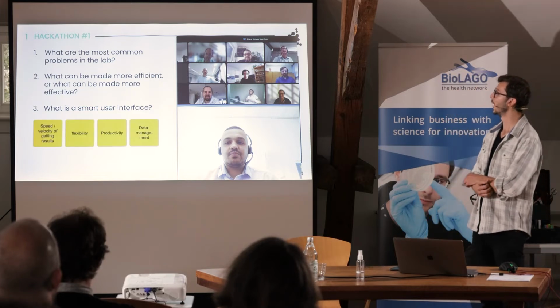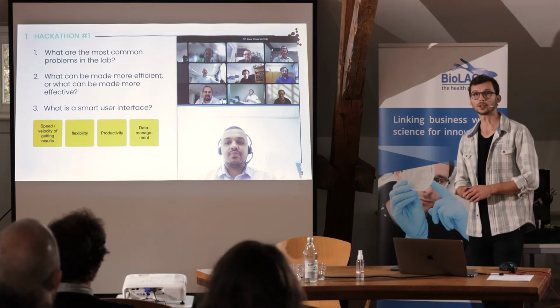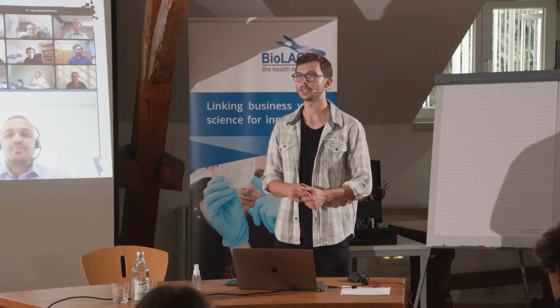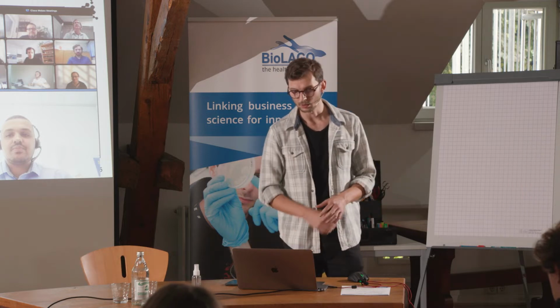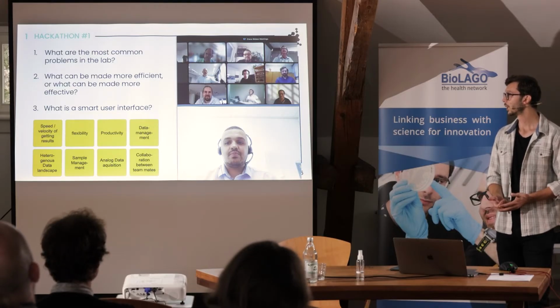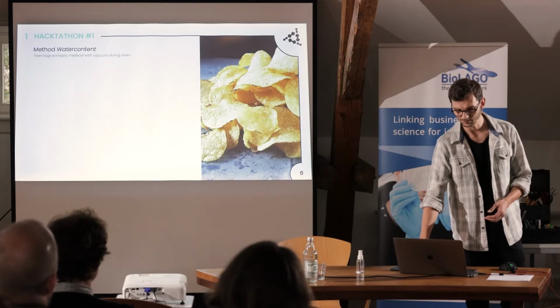Some answers from the attendees of the first hackathon were flexibility in the laboratory and also more productivity. A very common problem and hurdle is data management overall, so combining different formats. Other hurdles and problems are heterogeneous data, sample management of course, and analog data acquisition, so still working with paper and pen in the laboratory.